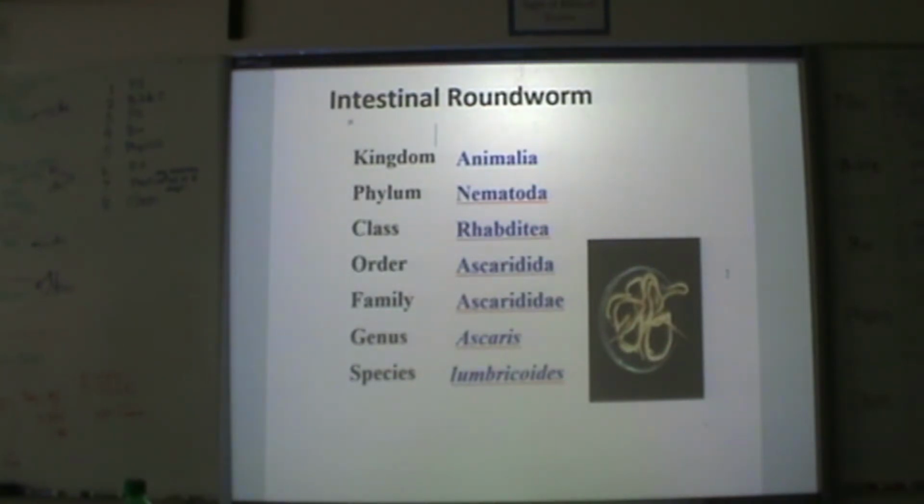And when you get to the earthworm, there is no gender in earthworms. They are actually both genders. They're hermaphroditic, and that's why there are so many earthworms every time they come up. And two earthworms mate. Both earthworms have a sac full of fertilized eggs, which was God's way of really building up the bottom of the food chain, that there are plenty of animals that live almost entirely on earthworms because there are so many of them. All right, I will let you go ahead and get to the dissections.